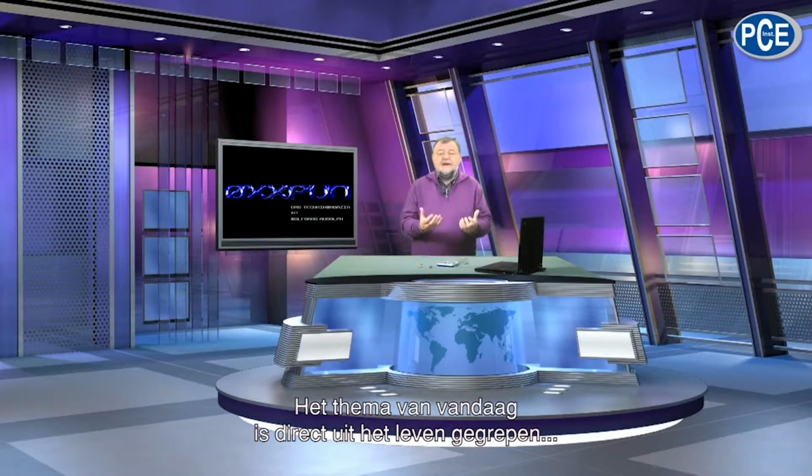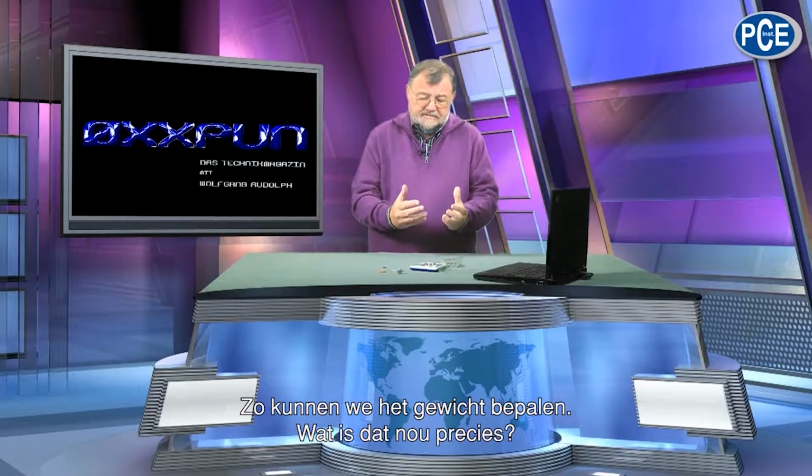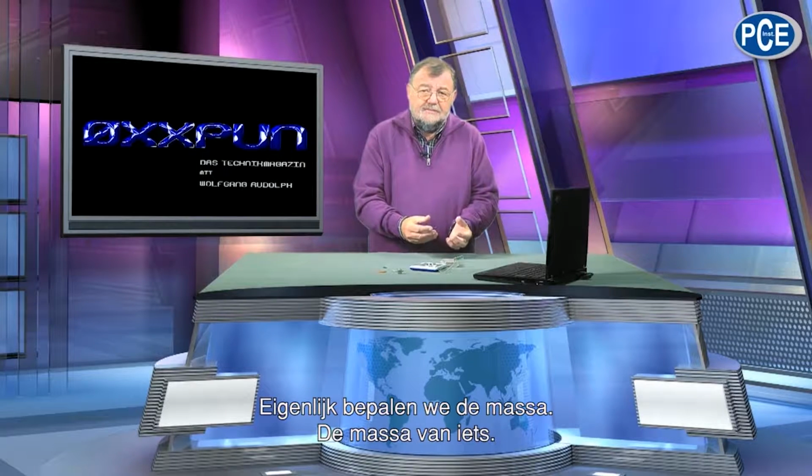Today we have a theme which comes directly out of our lives, of course. I want to go into industrial products which are very, very important. Of course, in households we have to weigh, that we determine the weight. What is that exactly? Actually, we determine the mass.